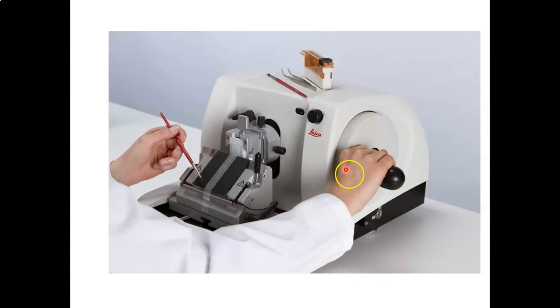This is the wheel of the microtome, and this is the thickness we require, usually from 5 to 10 micrometer. You remember the micrometer equals 10 to the power of -6 of the meter. Then I will put the block and start to cut the section into thin serial sections.